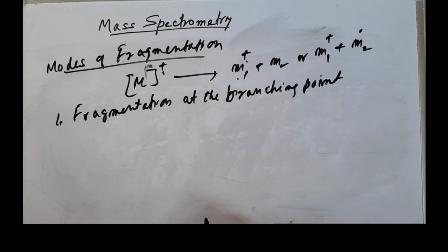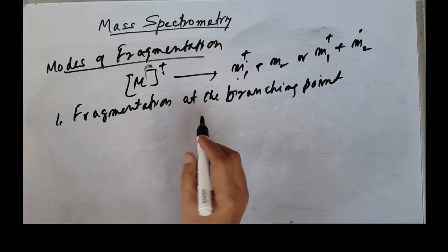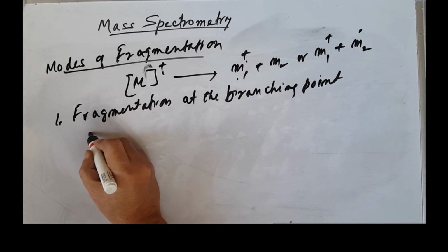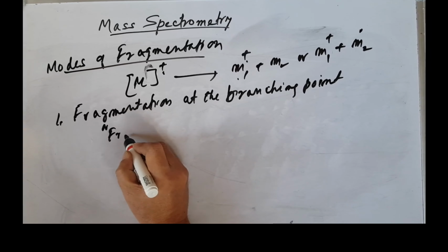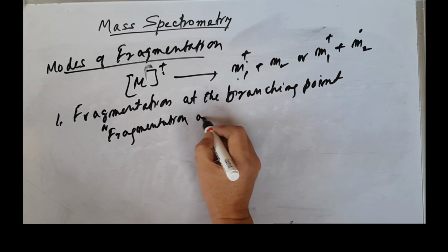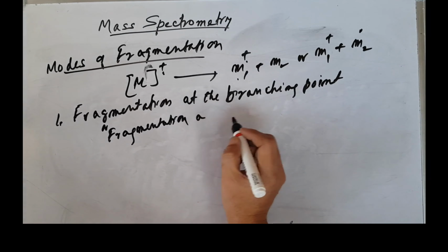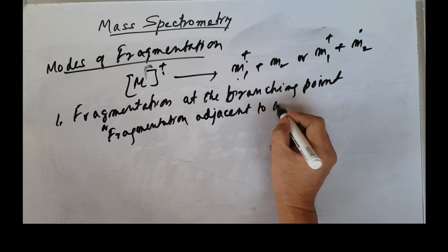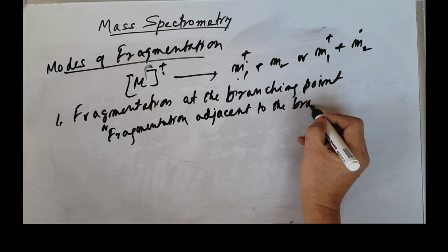So here I can say fragmentation adjacent to the branching point.